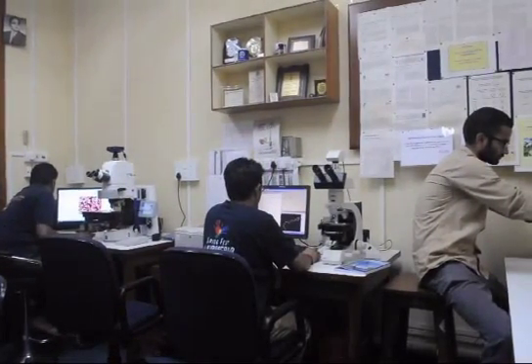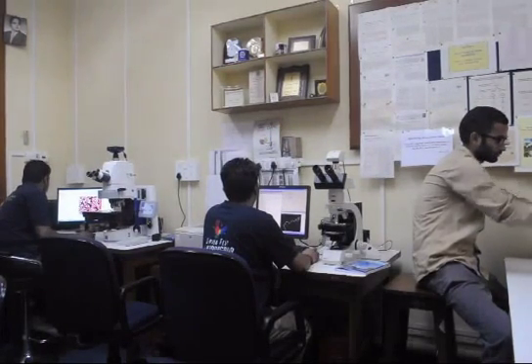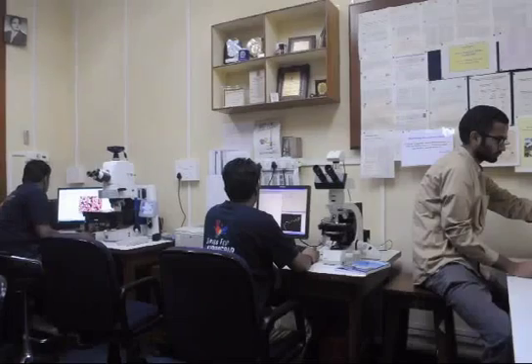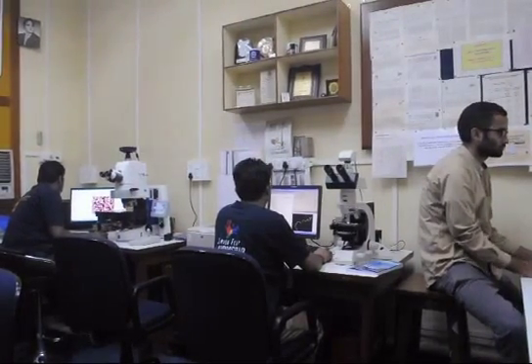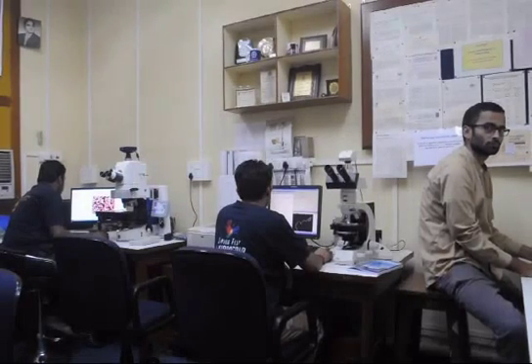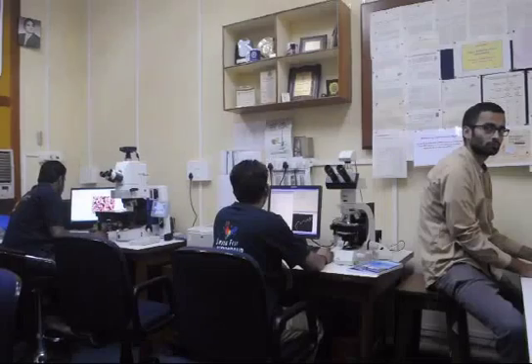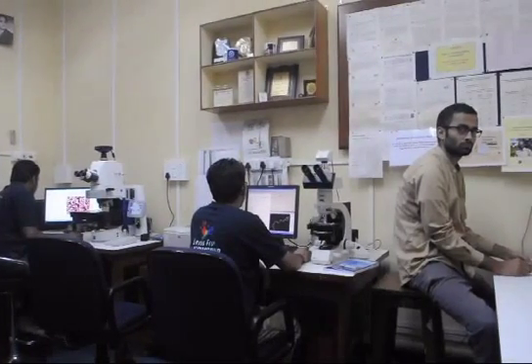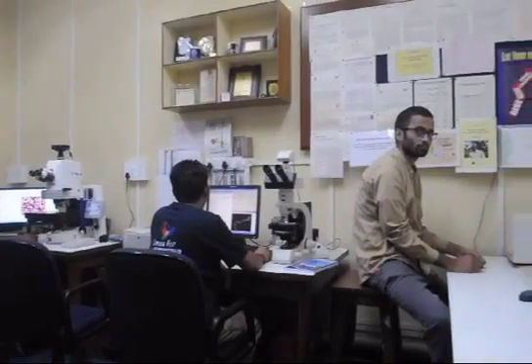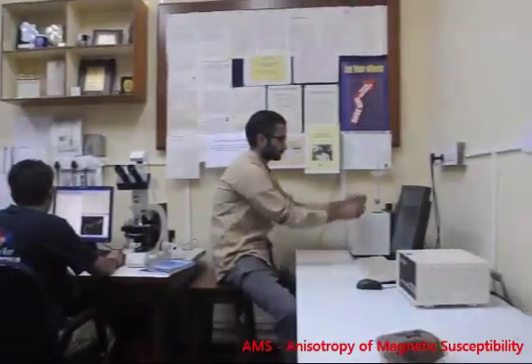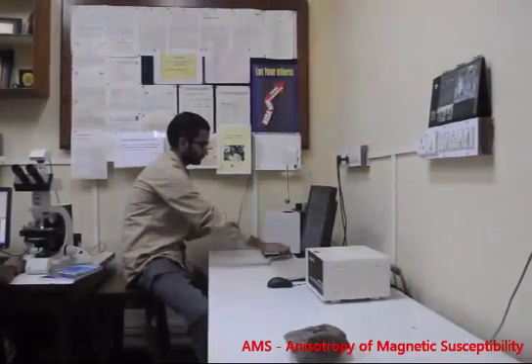Vishnu is sitting at the new automated XY stage microscope doing digital image analysis of a 25-image mosaic of a quartzite thin section. Rana is busy doing petrography and fractal analysis, and Sandeep is busy working with the cores.